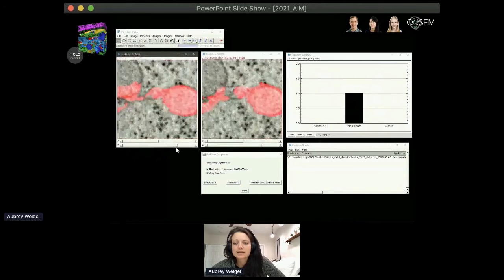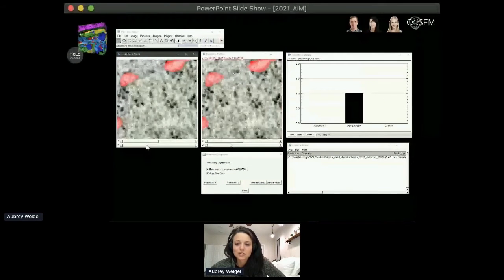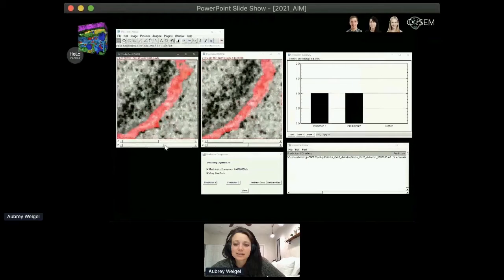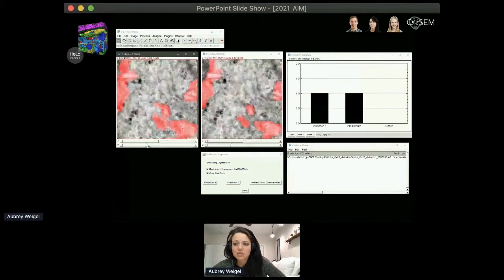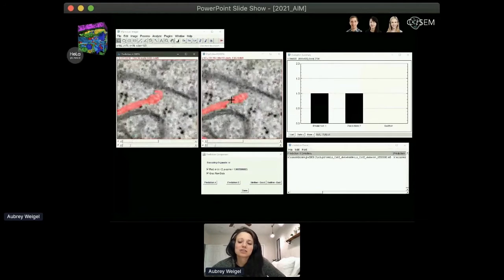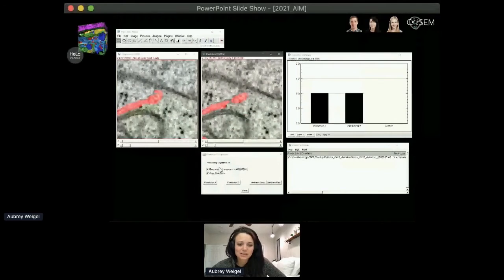The user inspects the stacks and selects which prediction, if any, did a better job of predicting the chosen organelle. Note here that the crops are randomly labeled, so the user is blind to which image came from which prediction. The plugin calculates and reports a p-value corresponding to the null hypothesis that the two networks perform equally well. This evaluation process then repeats for a new crop. Evaluations are performed until, after a minimum of 100 evaluations, we can reject the null hypothesis, and the network that performed best is deemed the winner. No ties are allowed, and that forces us to choose which network performed better.